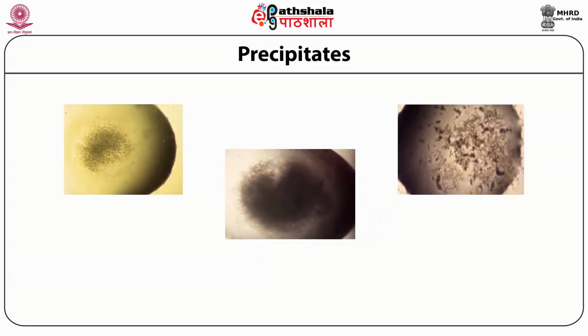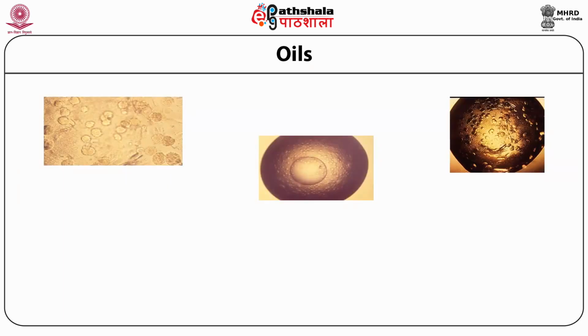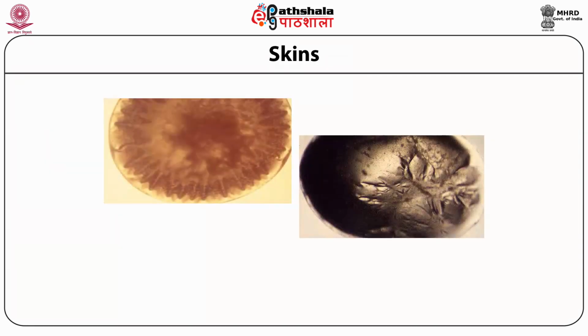So when we try different crystallization methods, you don't always end up with crystals; you get many kinds of precipitation. Here you can see different precipitation methods. It could be light or dark precipitation. It could be simply oiling, the phase separation between the precipitant and the protein. So the protein is separated, like oiling on the surface. The protein could also form skins. If the oiling is pretty bad and the protein precipitates, it could form ugly skins.